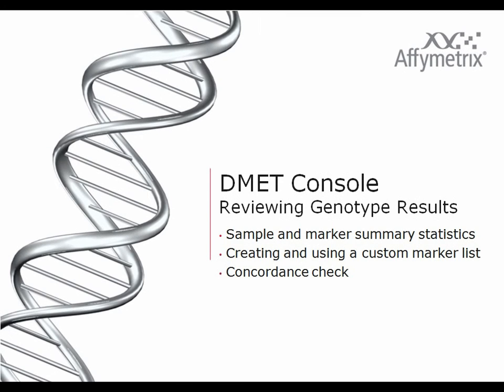This section on DMET Console software is about reviewing genotype results with a focus on sample and marker summary statistics, creating and using a custom marker list, and concordance check.